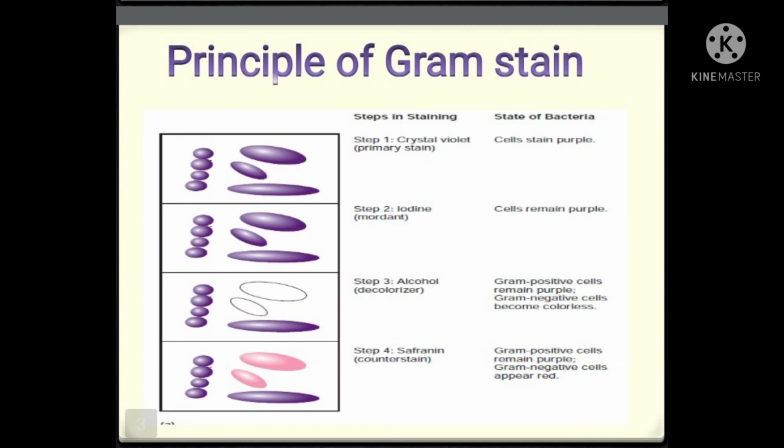Now, let's learn about the gram staining procedure. In the first step, the smear is stained with the basic dye, that is crystal violet, the primary stain. This is followed by treatment with an iodine solution functioning as a mordant. At that time, crystal violet iodine complex is formed. The iodide increases the interaction between the cell and the dye so that the cell retains a stronger color.